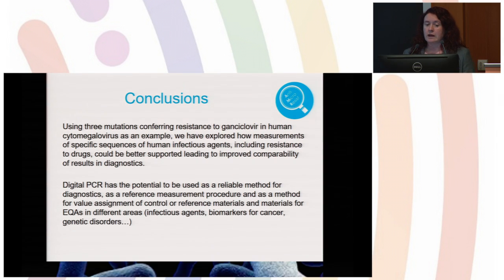So to conclude, using these 3 mutations that are giving resistance to ganciclovir in human cytomegalovirus, we have explored how measurements of these specific known sequences could improve measurements of infectious agents, including their resistance. And we believe that this way diagnostics could be improved and be more comparable between different clinical laboratories.